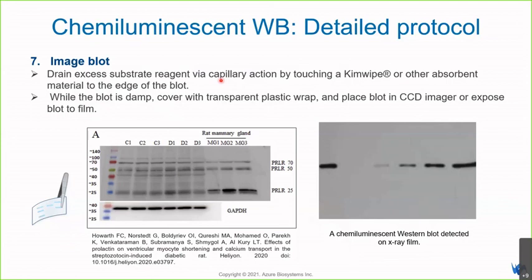Cover it with transparent plastic wrap, or you can insert it inside a folder. Just keep it moist at all times. Place the blot in a CCD imager or expose the blot to film.